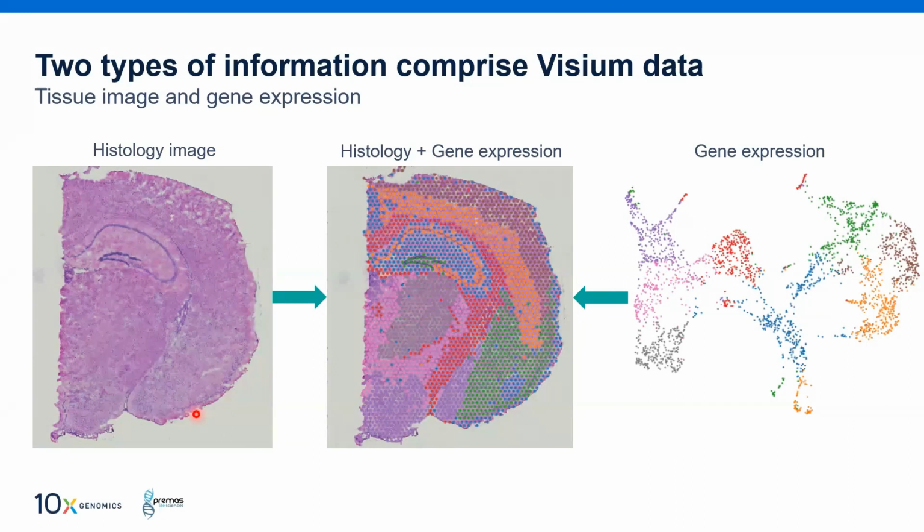So now this technology is going to help you capture the RNA spot-wise, meaning location-wise, and give a specific barcode, like the cell barcode we are giving. And ultimately, when you sequence the data, you will be able to map it to the location. So here you can see the different cell types, or we can say tissue types, clustering together, and ultimately all these clusters are going to be mapped at different locations.